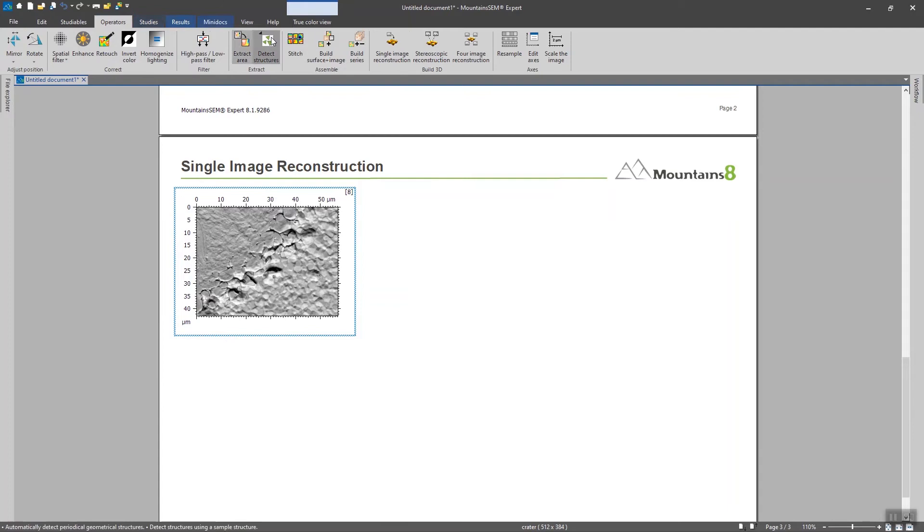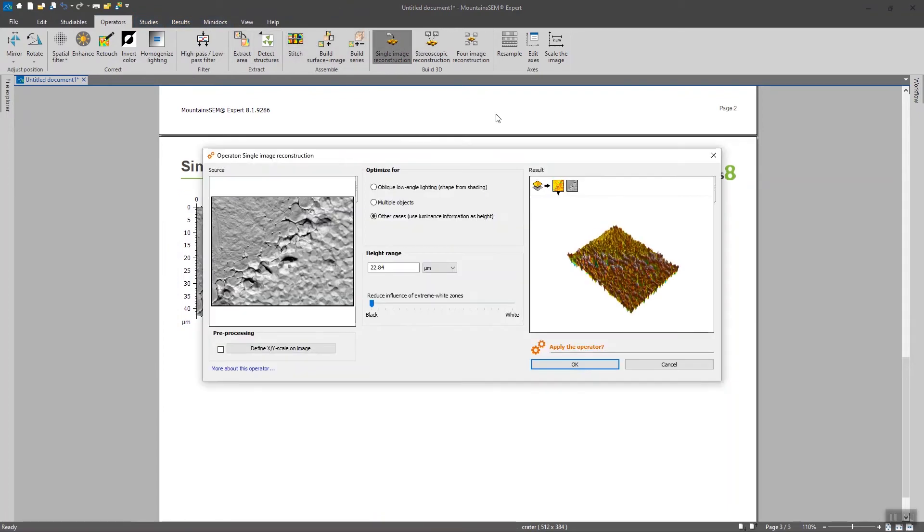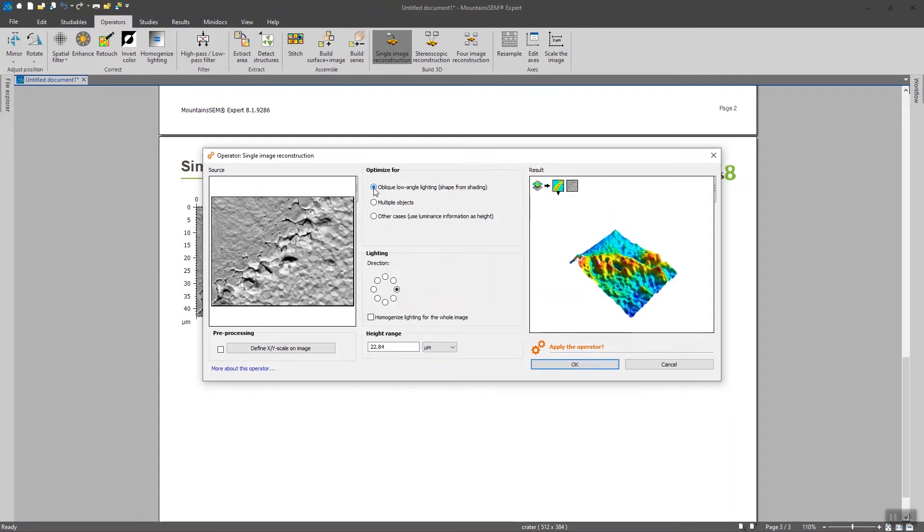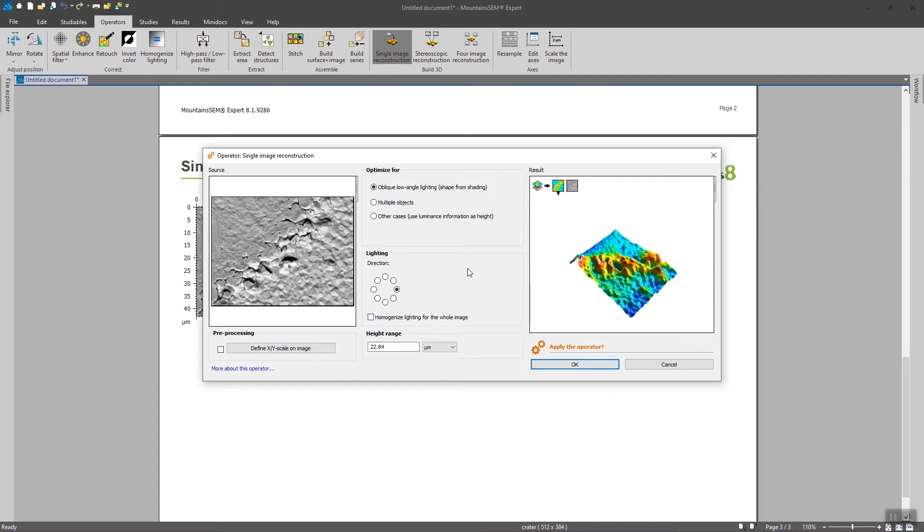So again I'm going to operators and I'm going to use the shape from shading technique in this case. The software is going to automatically detect, well not automatically since we are going to give an approximate direction of the beam but the software is going to detect where the beam of the light source was coming from.